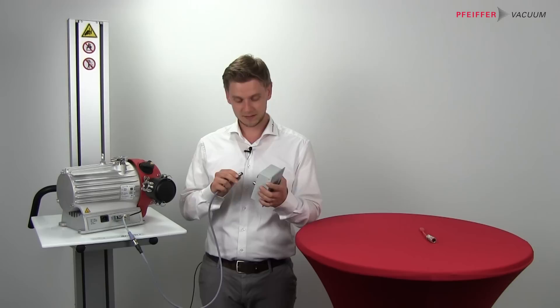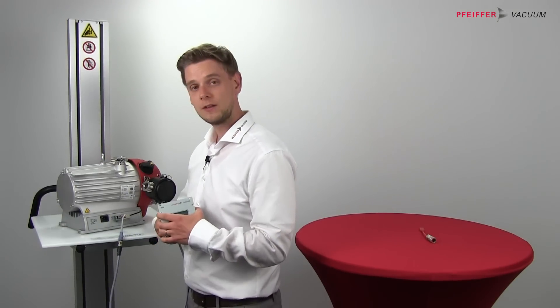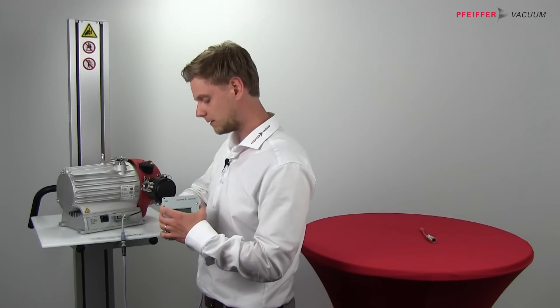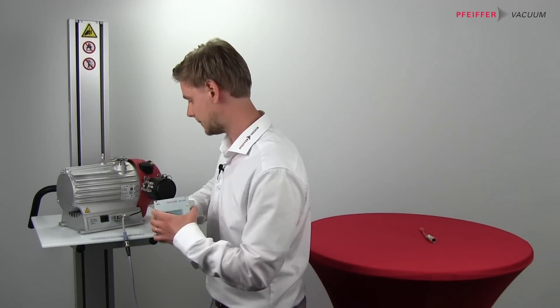Now we can connect the DCU to the HiScroll. By the way this is the HiScroll 6 I am showing you today. And the accessory is compatible to all of the three pumps. The HiScroll 6, 12 and 18.